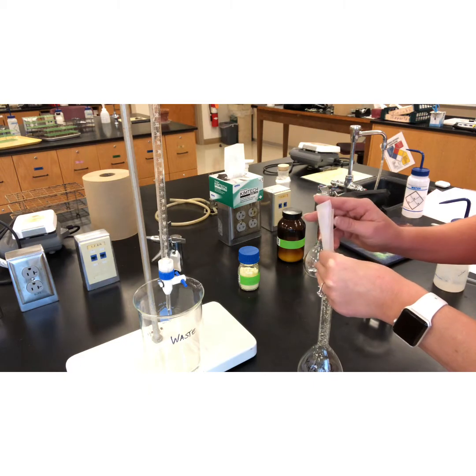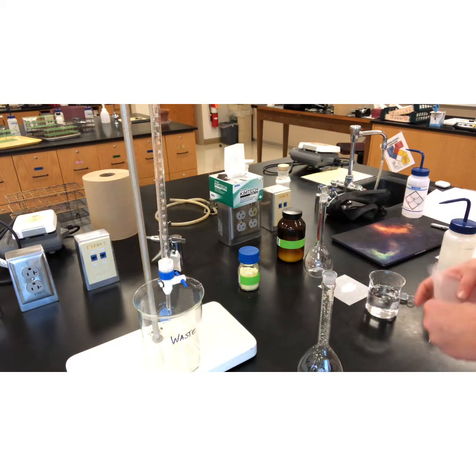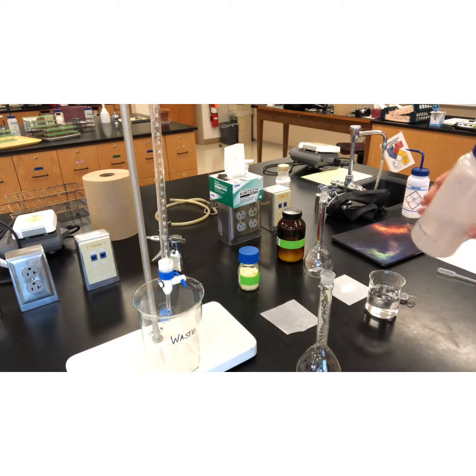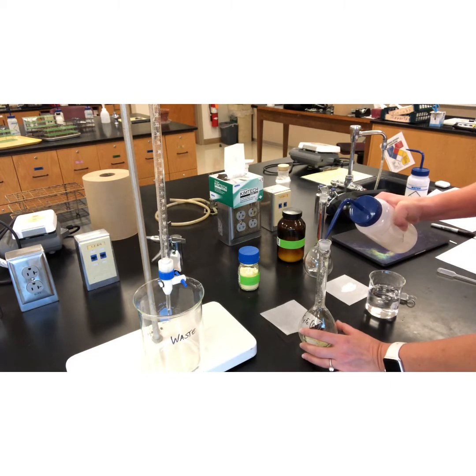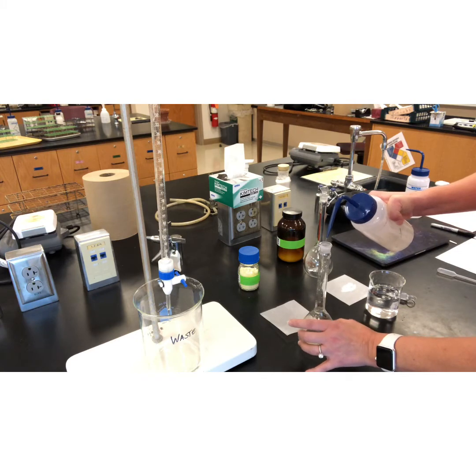All right, so we are being quantitative, so we do want to be careful with our numbers and our procedures and keep track of everything. Of course, we will have a little bit of loss, but we won't have too much. Now I'm creating the solution, and I'm going to add deionized water to it. I'm going to squirt this DI water so it rinses everything down the neck.